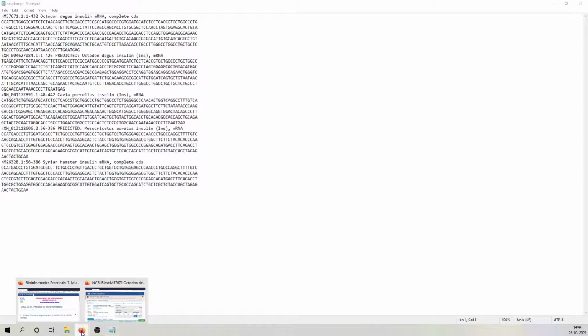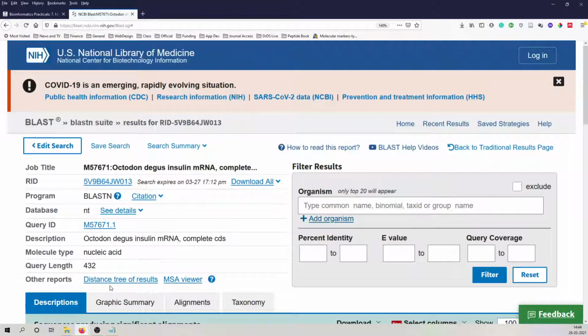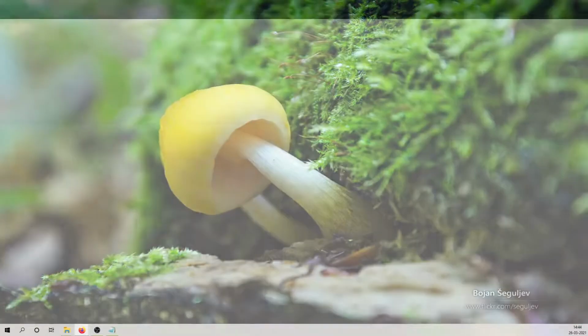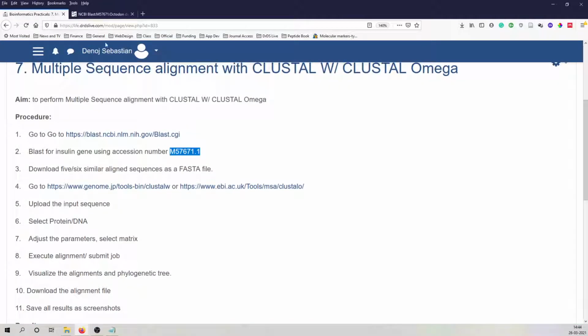Okay. Now you come to the procedure. In the procedure, we have 2 websites given.